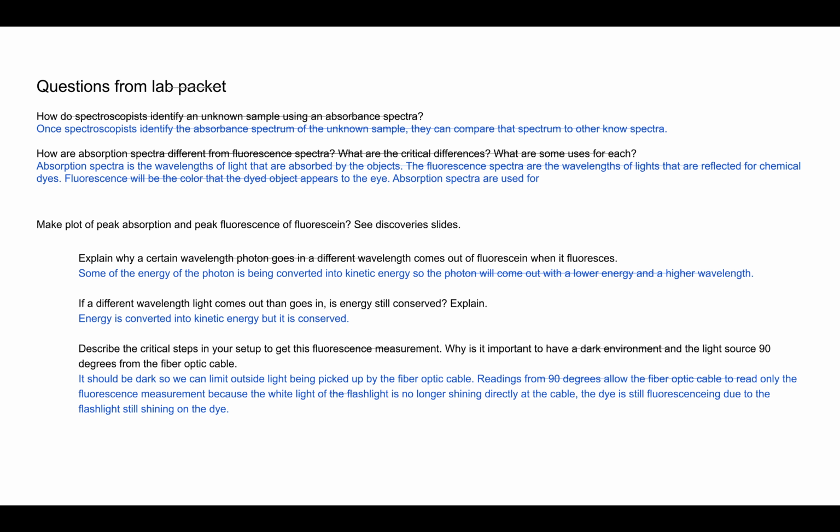It should be dark so we can limit outside light being picked up from the fiber optic cable. Readings from 90 degrees allow the fiber optic cable to read only the fluorescent measurement because the white light of the flashlight is no longer shining directly at the cable. The dye is still fluorescing due to the flashlight still shining on the dye.